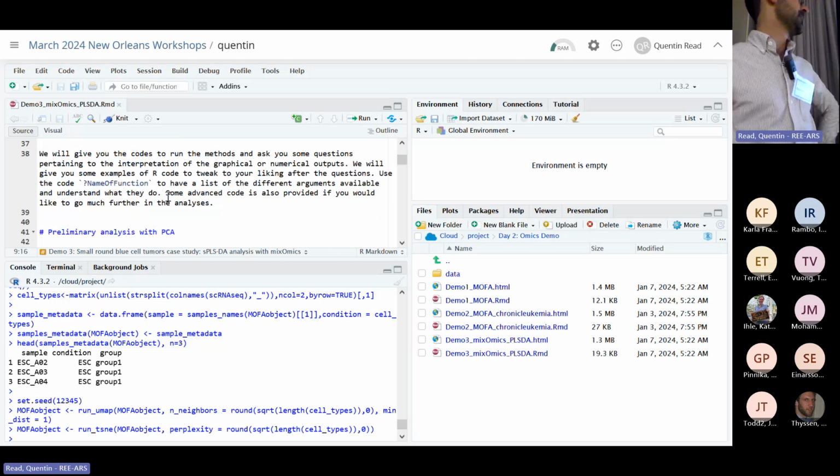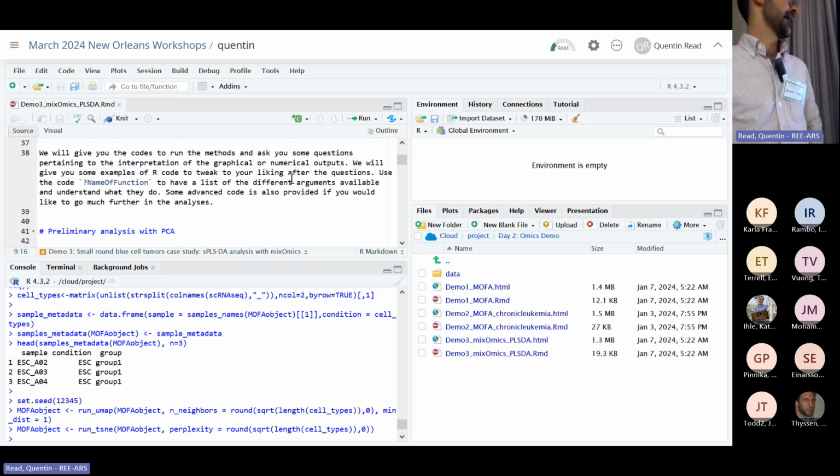So again, there are some little homework-style questions here and there in this, but we're going to skip over those. But I encourage you to go back and look at those because there are answers in there as well. The questions are more about how to interpret the data. We'll go over it as much as we can in the time we have.